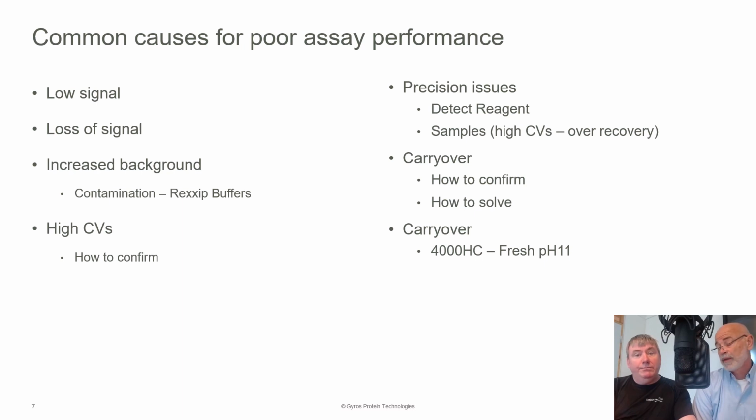I think one of the real keys here is that looking at the two viewer profiles from the two replicates can tell you a tremendous amount about what's going on. Exactly. Because the viewer often auto scales things, you might see a peak that looks exactly the same. That would indicate that you're seeing specific signal, but if one is higher than the other, that gives you a clue about where that signal is coming from.